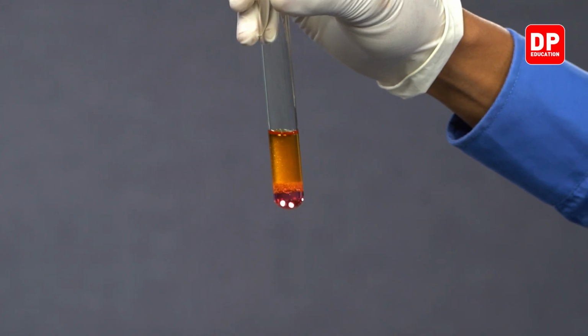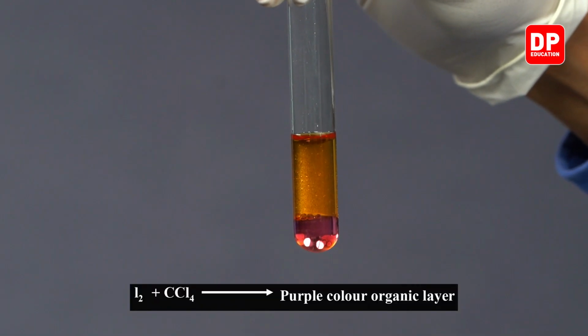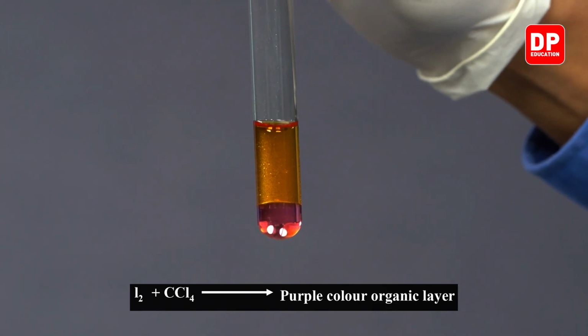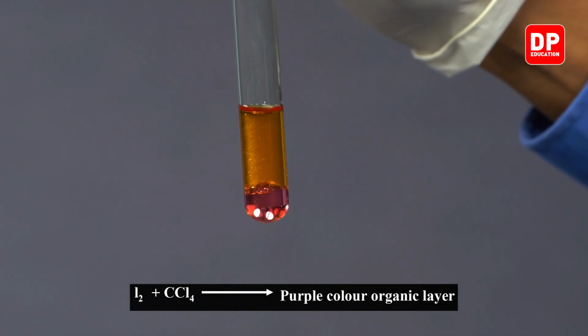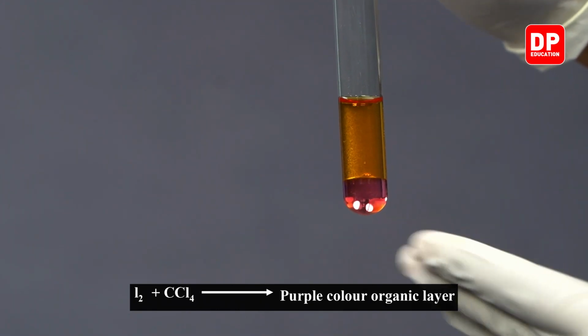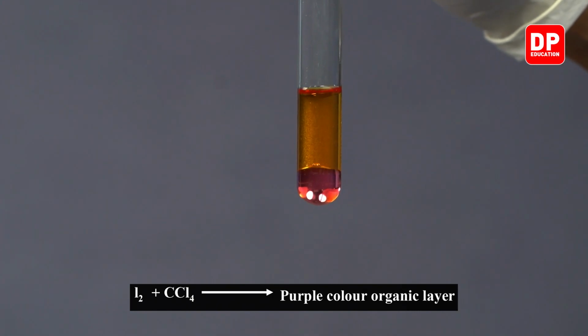Upon mixing it thoroughly, you can see that the organic solvent layer, which is the carbon tetrachloride layer, is turning purple. It has turned purple compared to how it was before. This is due to iodine dissolving in the CCl4 layer.